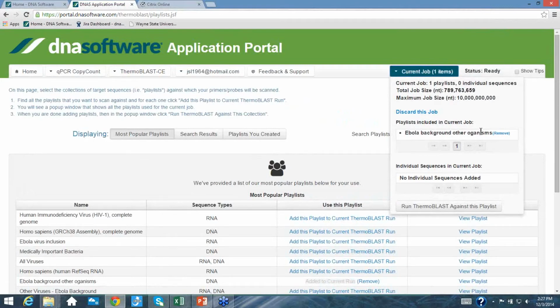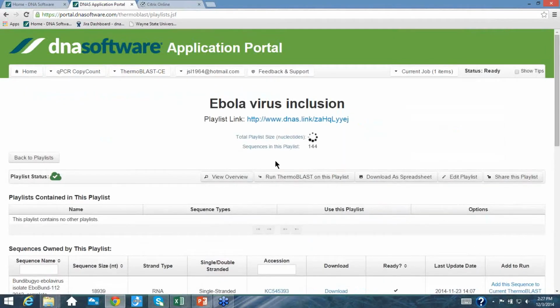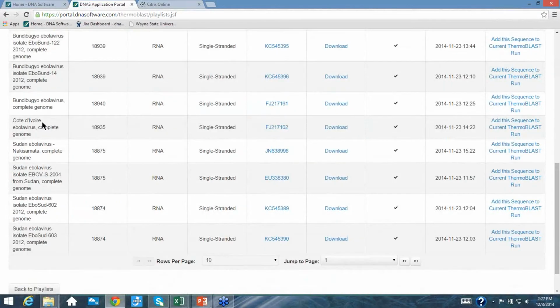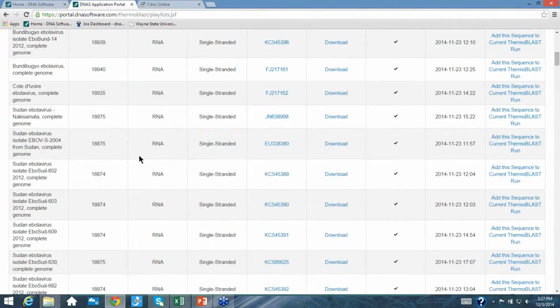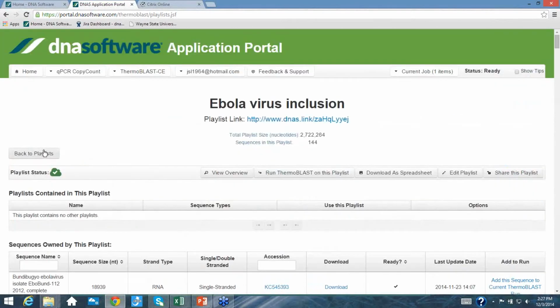All right, so with that, we'd be ready to run it. If you're interested in knowing what's in there, you can click on the View playlist down here. If you do that, it takes us out of that window briefly and shows us what's in there. 144 sequences in that playlist, and here they are. Okay, so it's got a whole bunch of variants of Sudan and Zaire and lots and lots of. You can view all of them if you want here. So you can see there's Côte d'Ivoire and Reston and all the different variants of Ebola. It's 2.7 million nucleotides.